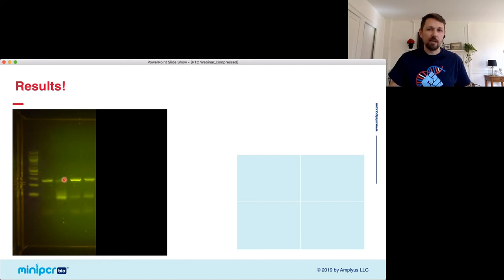So this one didn't have a great DNA extraction. And we see something here, it's called primer dimer. Sometimes with primers, if you see a band that's under 100 base pairs, it's because primers are binding to themselves in weird ways, and they're making products that we're not interested in. Pretty much as a rule, if there's a band below 100 base pairs that you didn't plan on being there, it's some form of primer dimer and you just ignore it. Those primer dimers are more common when the DNA extraction isn't as good because it doesn't have the correct DNA to bind onto.